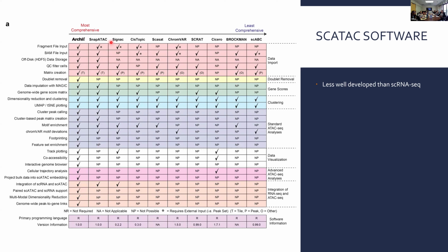But there's also Signac and Seurat, which are becoming more popular for this approach, primarily because, unfortunately, it looks like the ArchR person, the guy who put that together, his lab is basically just him. I saw he's got a call out for someone else to come on board to help maintain this package, which I hope he finds, because it's a really comprehensive, really well-designed package. But right now it's been kind of stagnant for about a year. If these things keep going forward, I've started not being able to use it because there's other things I want to do and they're just behind the curve. So hopefully someone comes on board, because it is really good. You can do a lot of stuff with that.